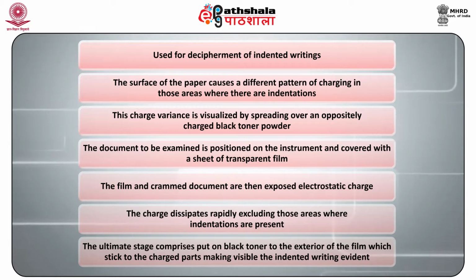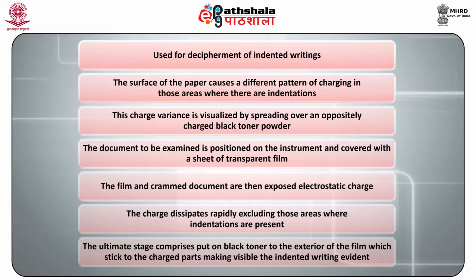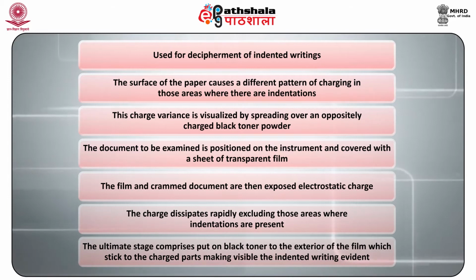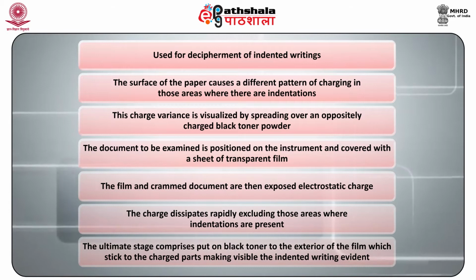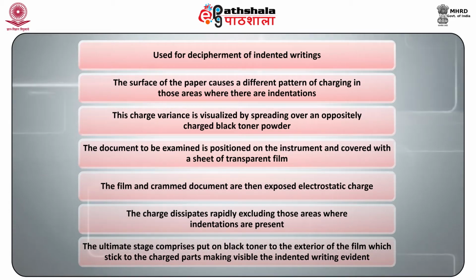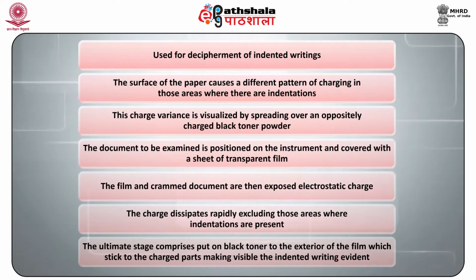It is the electrostatic detection apparatus used for decipherment of indented writings. The surface of the paper causes a different pattern of charging in those areas where there are indentations. This charge variance is visualized by spreading an oppositely charged black toner powder. The document to be examined is positioned on the instrument and covered with a sheet of transparent film.